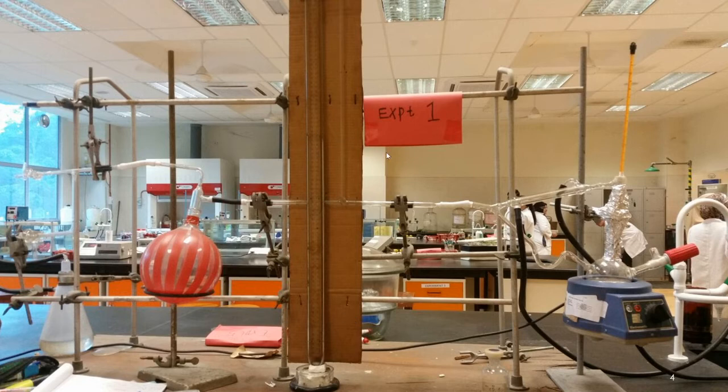Before you actually do the experiment, if you look very close here, inside the manometer is your liquid mercury. One part of the manometer is open to the atmosphere.